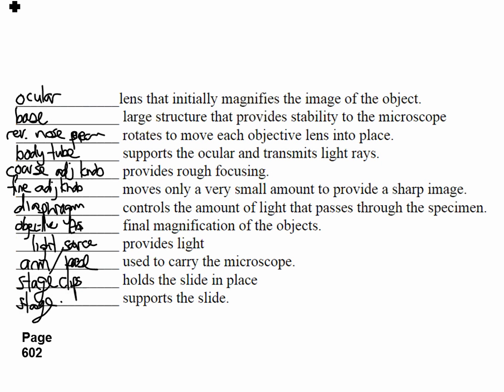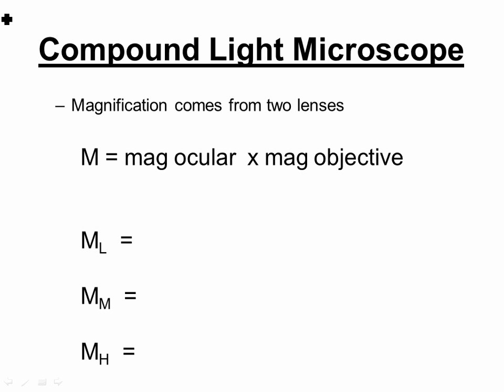When you put two magnifying glasses together at the right spot, you can get a real super magnified image. I don't know if you've ever tried such a thing. And when you do that, the magnification multiplies. You get the magnification of both, and you multiply their powers, okay? So when we want to determine how much something will be magnified, and I'm jumping ahead to here, if you go down on your document, does it say magnification on your document? So we're going to just keep going with this. It looks a little different than this, but I want to keep going on your document. I want to keep filling it in. This is going to be kind of your note.